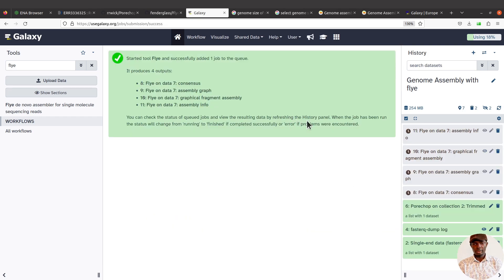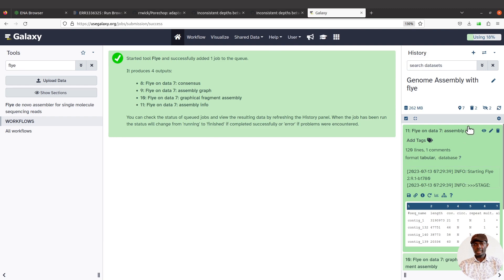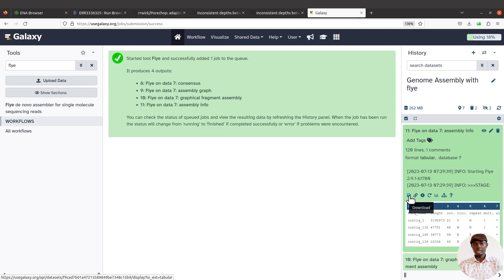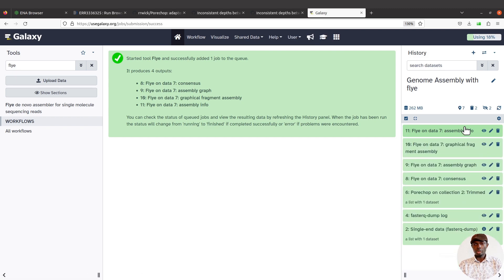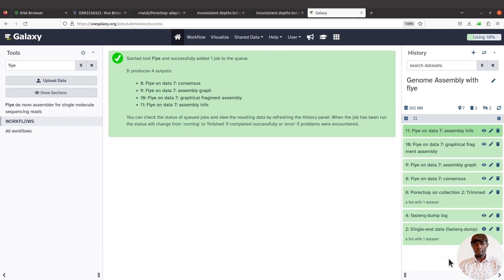Flye has completed. We have four outputs. First is the assembly info — click it to see the contigs with their respective lengths, coverage, and other details. You can download this file and explore it further.